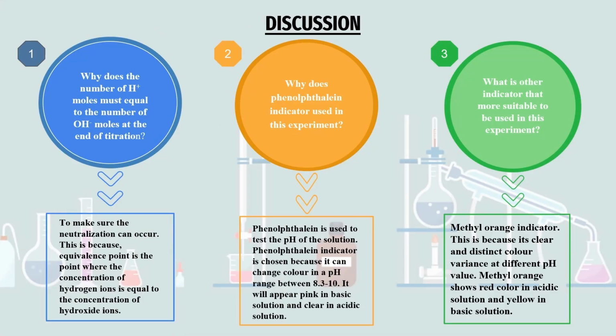As for discussion, there are multiple questions asked. Number 1, why must the number of hydrogen ion moles equal the number of hydroxide ion moles at the end of titration? This is to make sure the neutralization can occur.